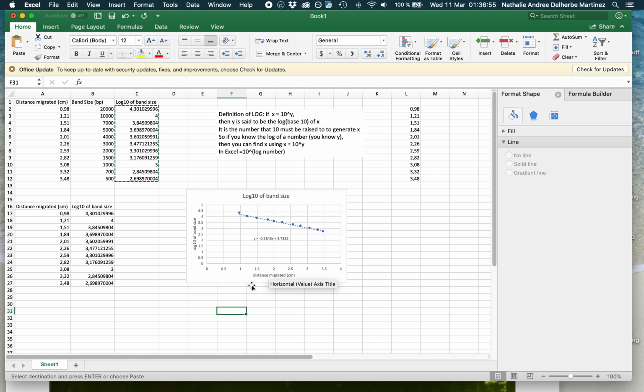Okay, so now we have the formula, and if you use it correctly, you want to solve for x. Sorry, let me see one thing here. Yes, that's correct.